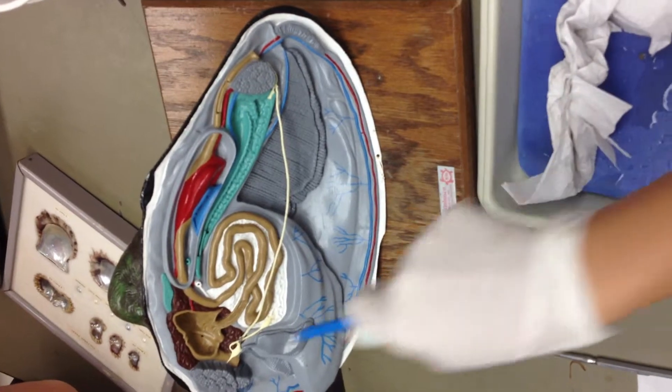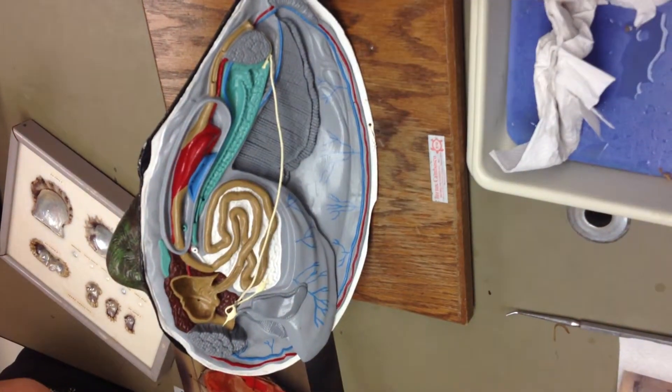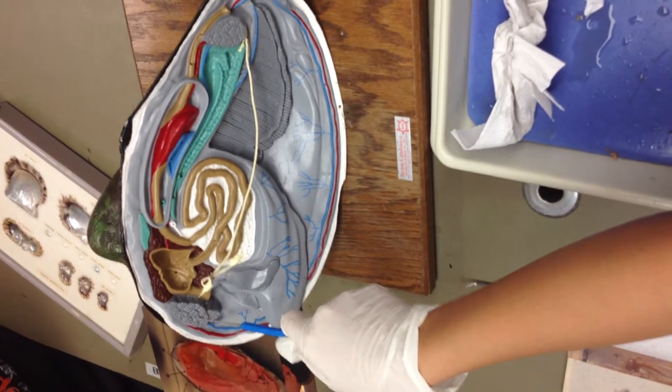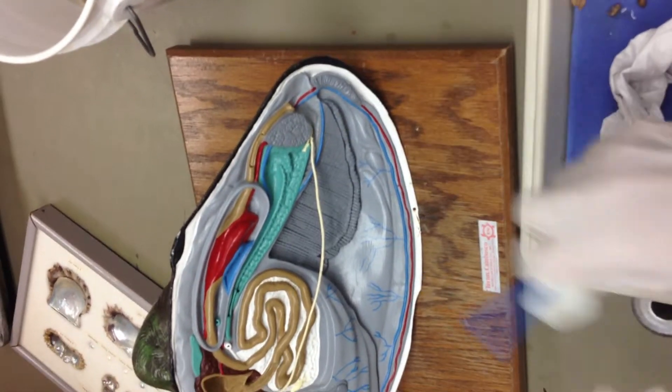Okay, here's our clam. The shorter portion is your front and the longer part is the back. So this is your anterior adductor muscle. That's your posterior adductor muscle.